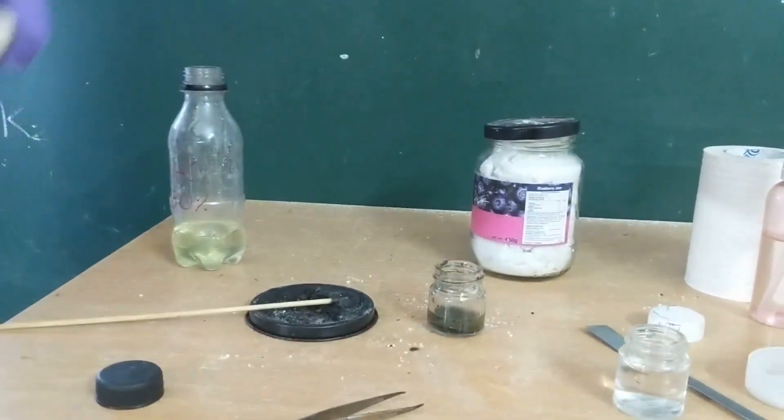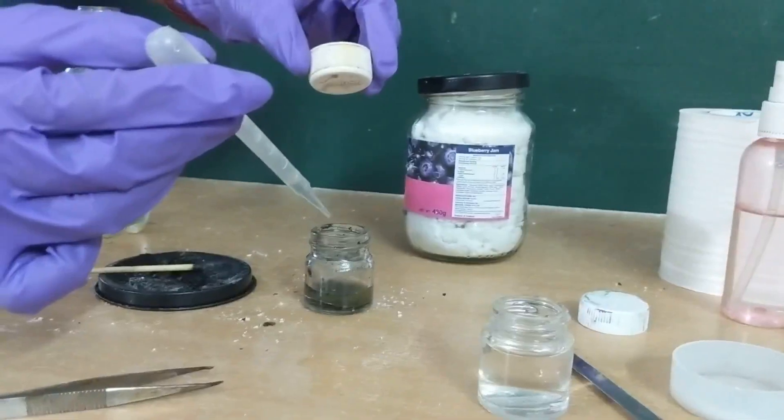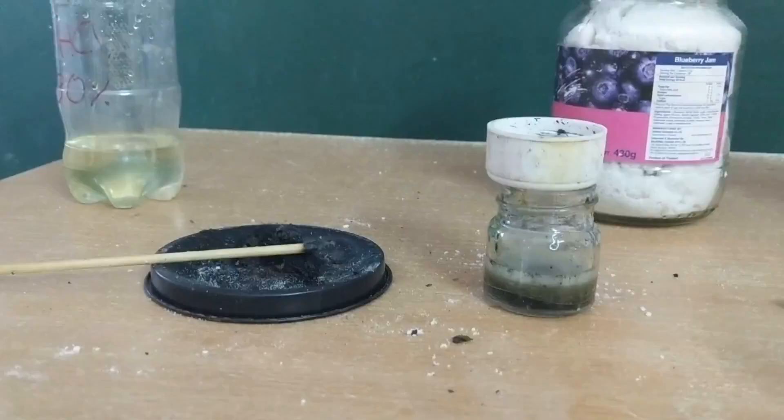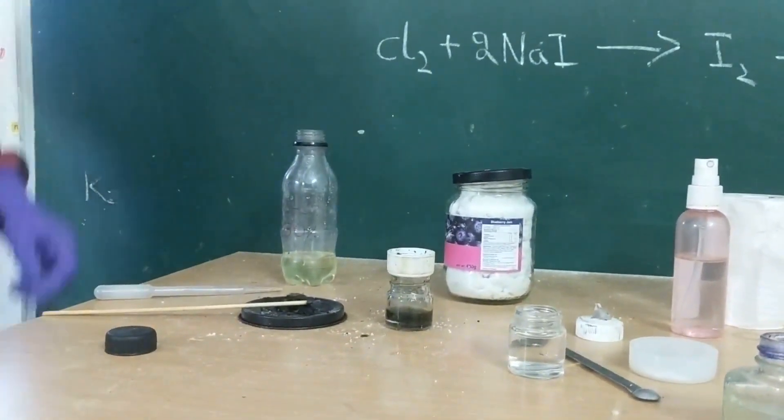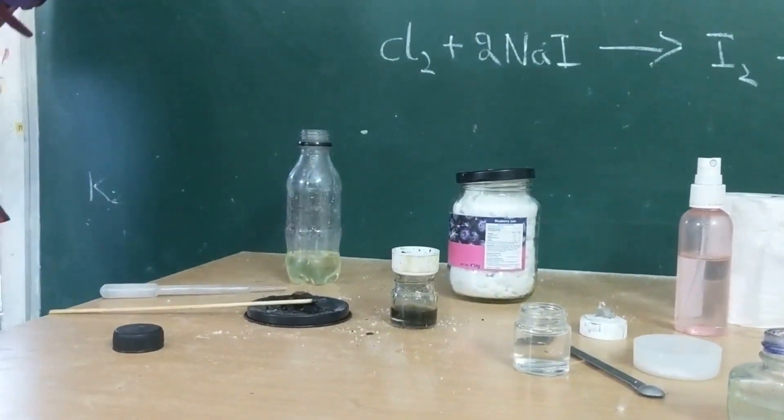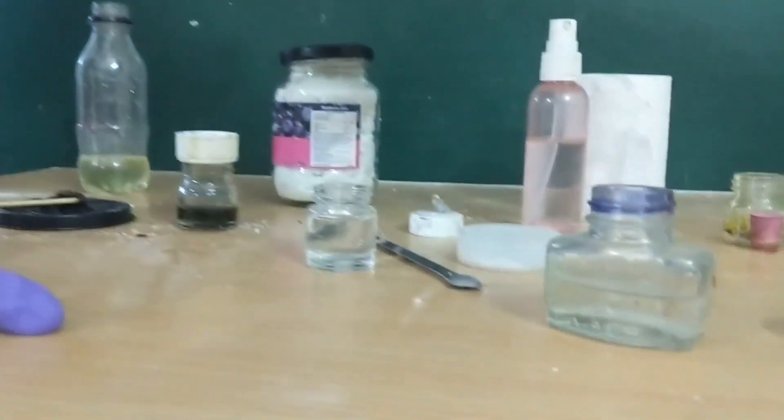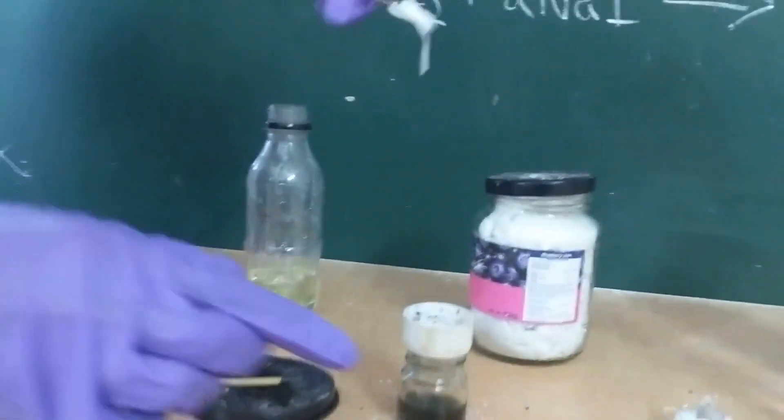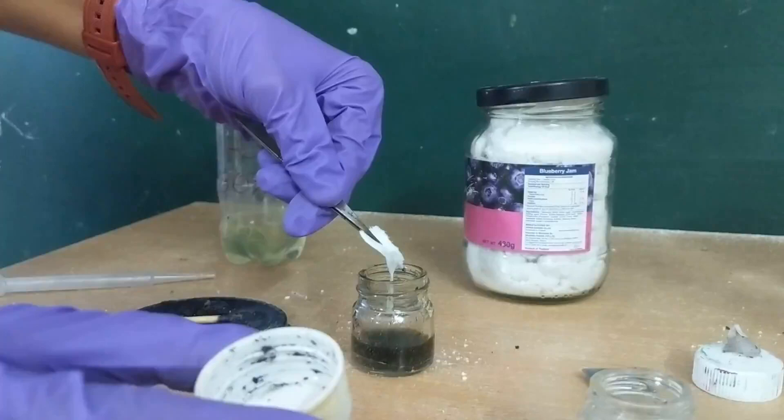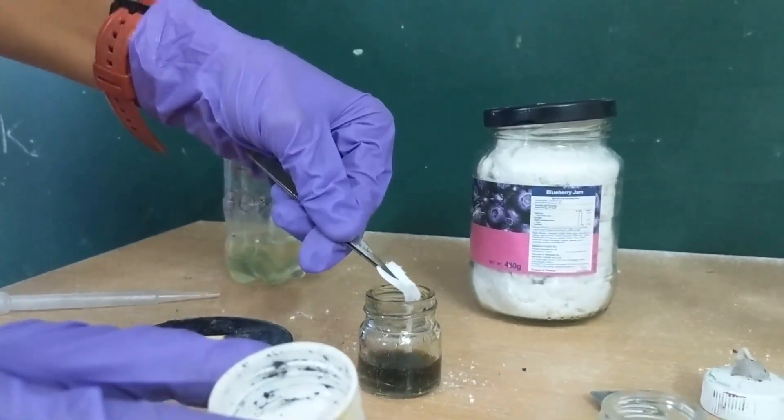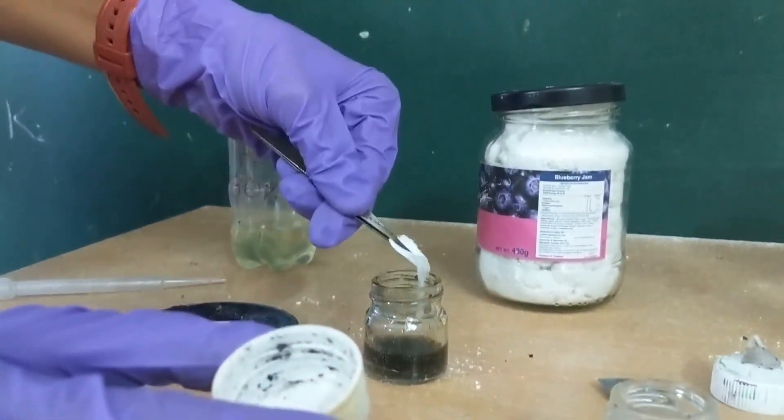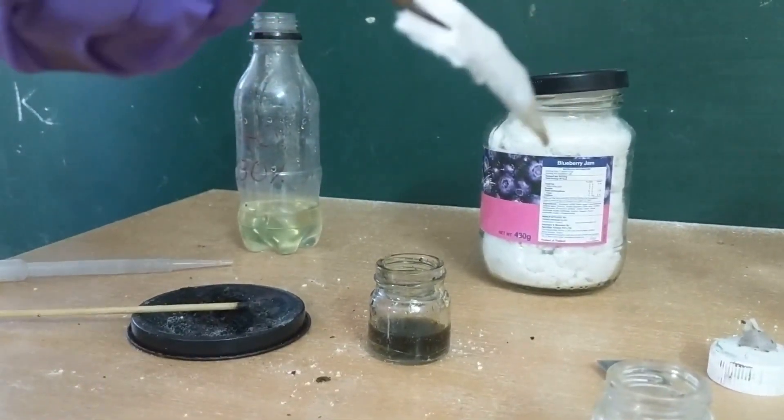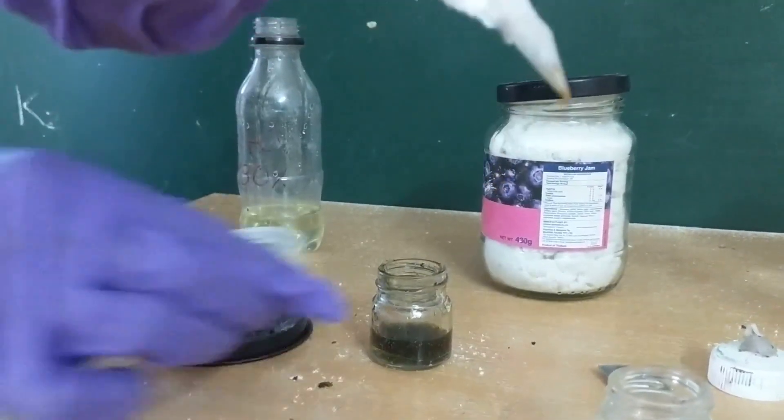So I have a few drops of concentrated HCl in this pipette. I'll add it and immediately close the vial. As you could see, there was a brisk effervescence of what we will now prove to be chlorine using sodium iodide solution. I have a piece of paper which I'm dipping in it, and we will introduce it into the chlorine-rich atmosphere.